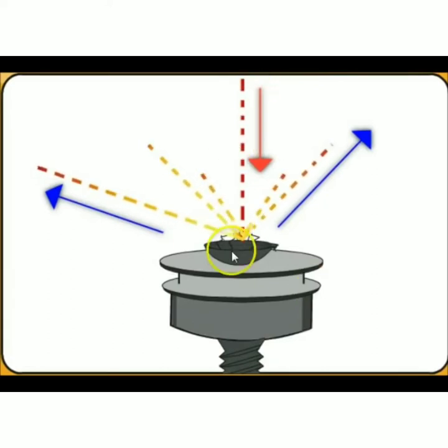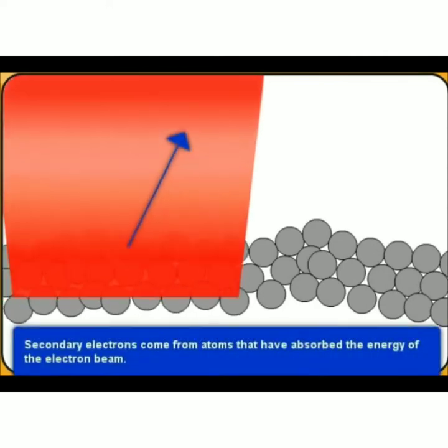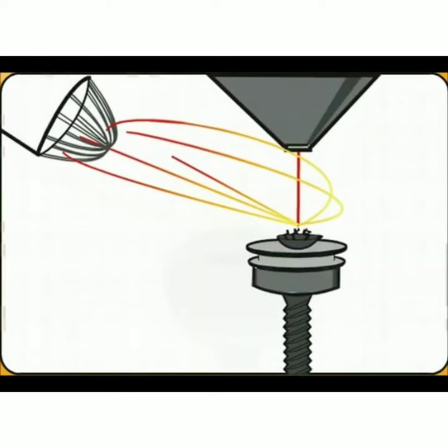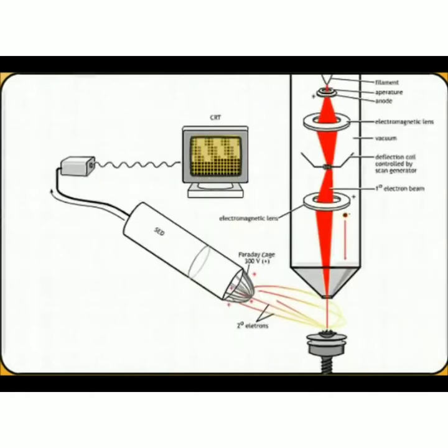So here you can see the electron beam heading down. It hits the specimen here, and then there's actually two types of electrons that are going to come off of this. In one case, we're going to get what are known as secondary electrons, and that is when the electron beam comes down and hits the atoms of the specimen, those atoms absorb the energy and give off their own electron. There's a detector to pick up secondary electrons over here, as you can see, and that detector has a positive charge on it. It's about 300 volts, which is actually quite a lot. And then once those electrons come into the Faraday cage, which is positively charged, they hit the detector. And then the detector uses the information from those electrons to form the image on our computer screen.